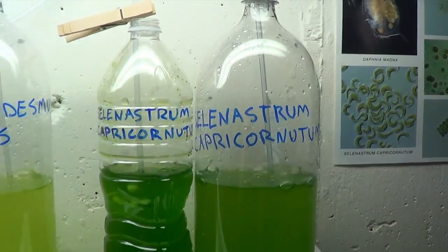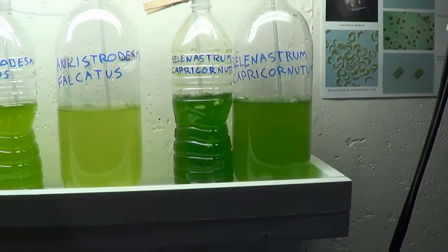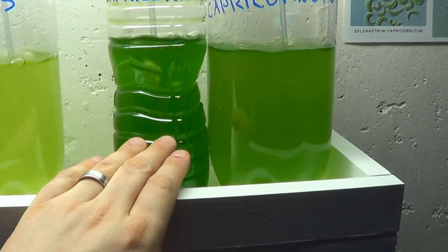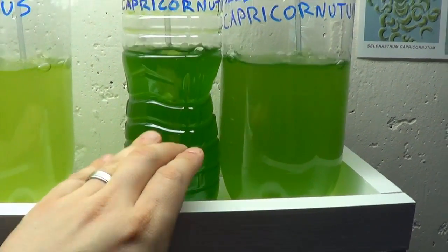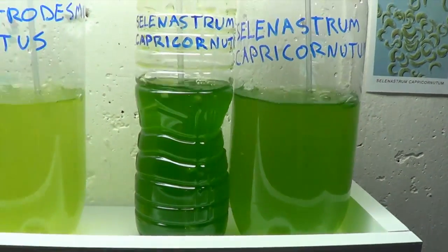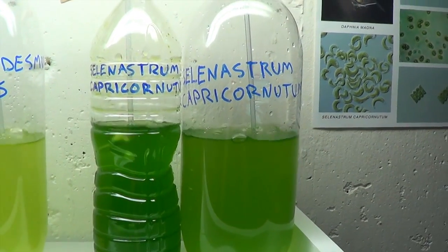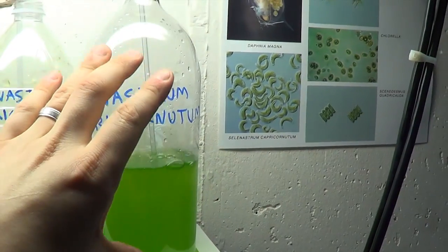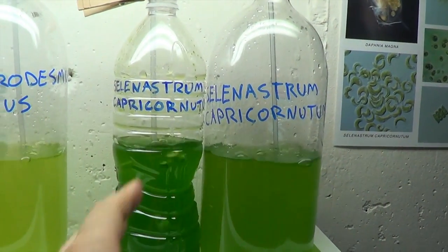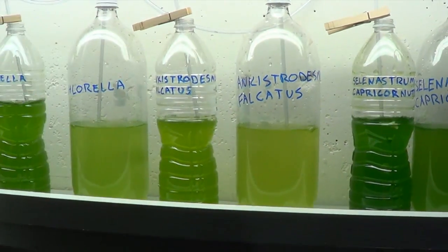So the 2 liter bottle is what I'm going with as a long-term solution, but because I got the algae originally in a small vial, I didn't want to dilute the starter culture too much, so I started with 500 milliliters or whatever that volume is, and I slowly scaled up. So in another week I'll probably be able to fill this 2 liter bottle. In another week I'll be able to replace this bottle with a second 2 liter bottle, and I'll have two cultures going, 2 liters each of each of those species.